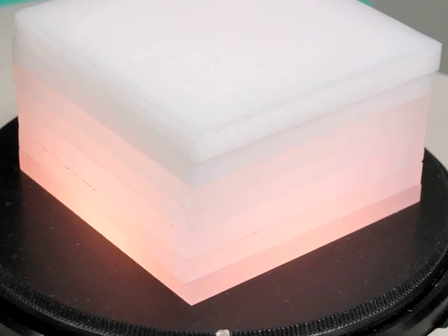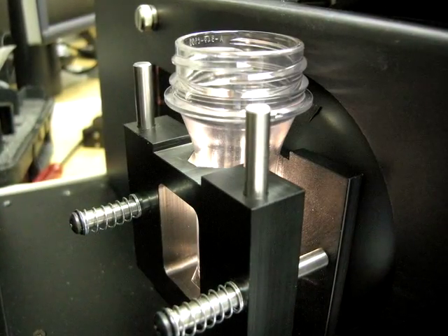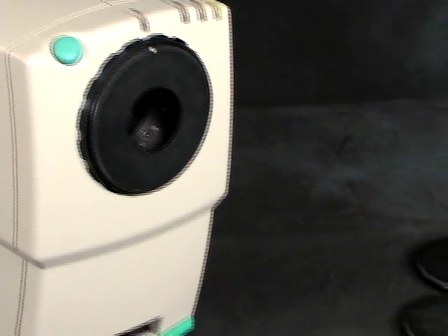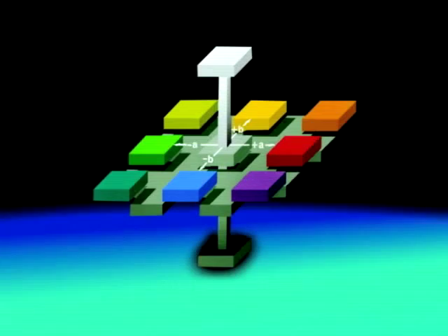The LabScan XE can also measure the color of flax and molded products. For measuring small items, the variable sample illumination option gives the system the ability to measure small sample areas.